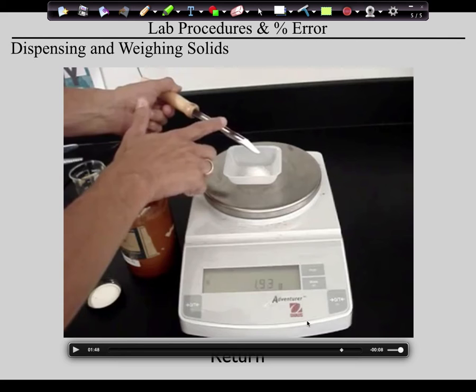If the spatula is contaminated, we've already contaminated the sample. So here's what will happen. When I set out stock bottles for you, you will not use your own spatula. I will set out a sterile spatula that can only be used with that chemical. So anything that's on the spatula is okay to put back, because if it wasn't, we contaminated it anyway by putting the spatula in the bottle.